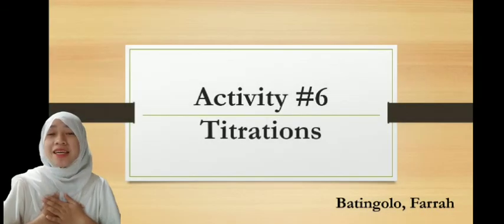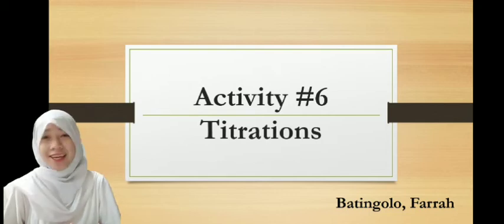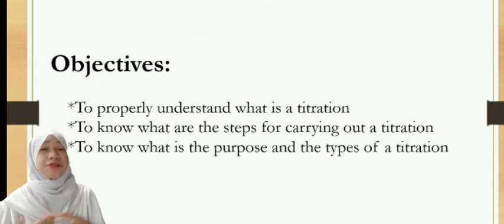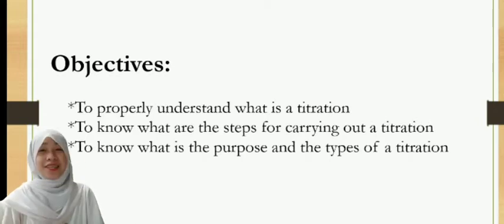I am Batingolo and I'm going to present my activity 6, which is titration. Before that, let me state first my objectives for today's presentation. First, to properly understand what a titration is. Second, to know the steps for carrying out a titration. And last but not least, to know the purpose and the types of titration. So without further ado, let's begin.